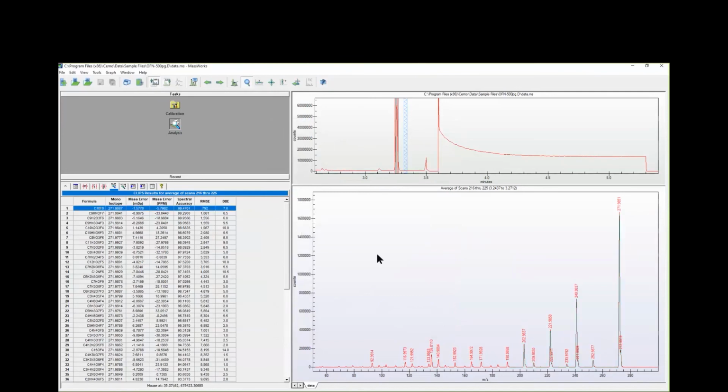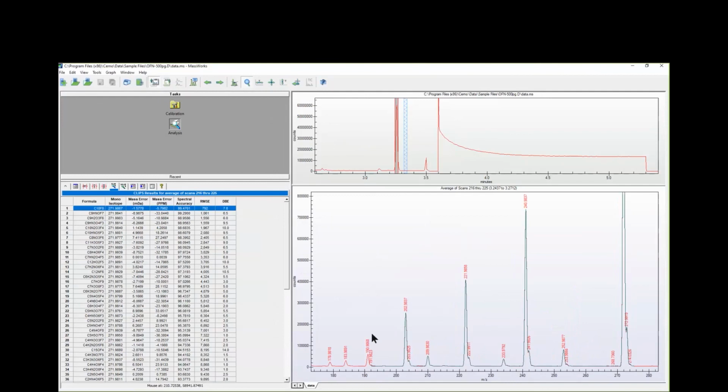what you see here is I've actually fit and explained every fragment ion here based upon that search. And you can see the fitting, the overlay of the black and the red is very good. The spectral accuracy is very good. And what's interesting is it'll also tell you what the relative concentration of the fragment ions are that make up this compound, because it had to actually go and fit all those fragments and figure out the best optimum fit. So it's pretty powerful. That's kind of a more interesting academic case.